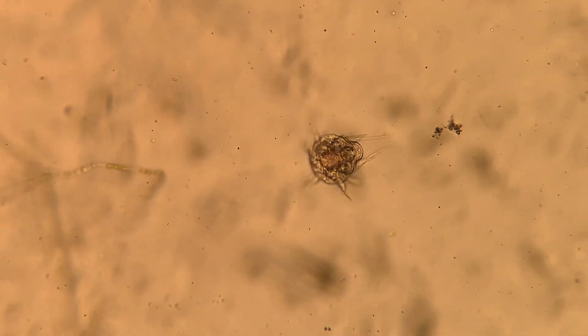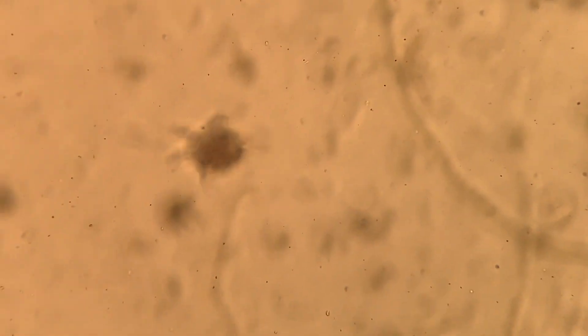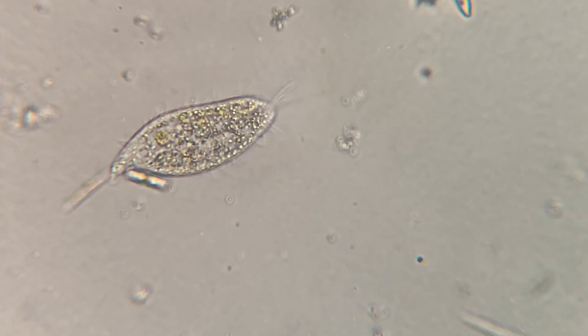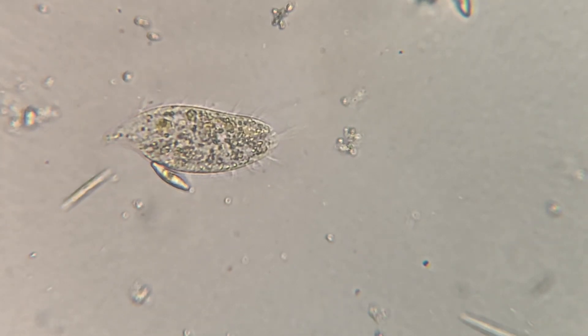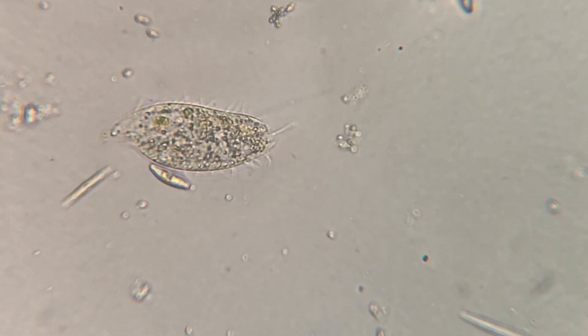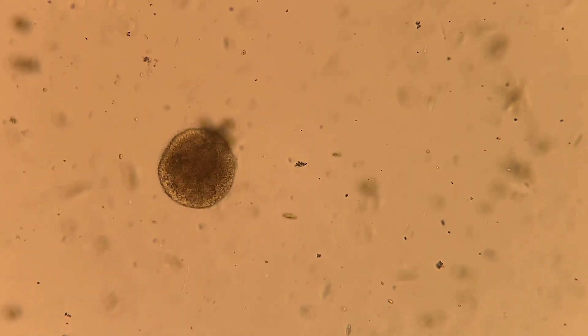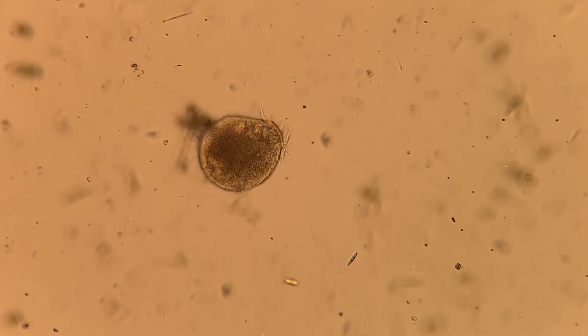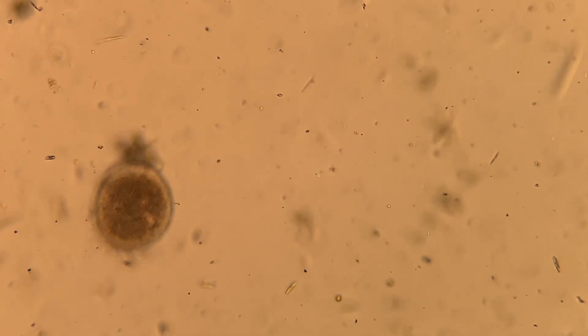In this sample, there were a couple of copepods, also known as cyclops. These guys are pretty cool — kind of microscopic crustaceans. There were also a bunch of ciliates in this sample, just little guys that looked really fuzzy all around. Honestly, I'm really surprised by how much I found in this sample, especially the variety. This was all found inside of and attached to the ice, so it's pretty cool that these guys were all able to survive.